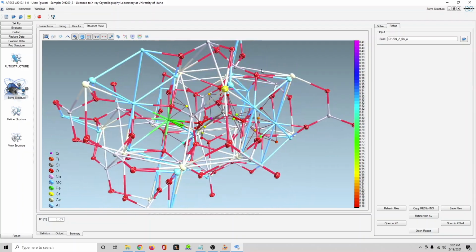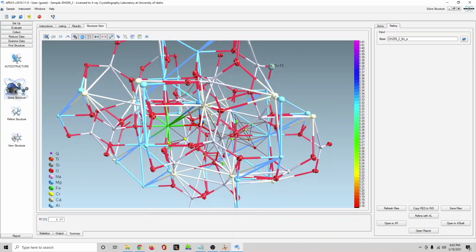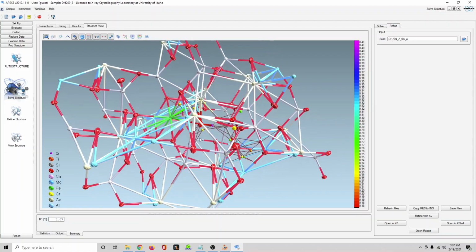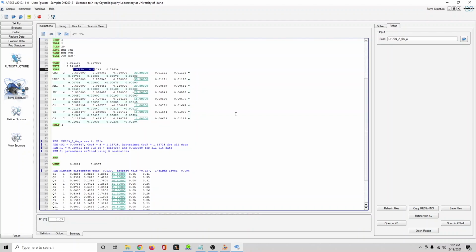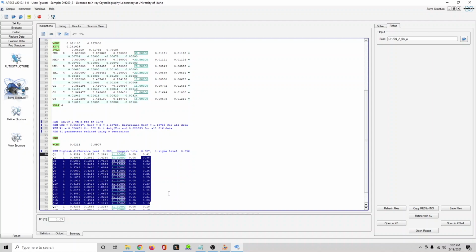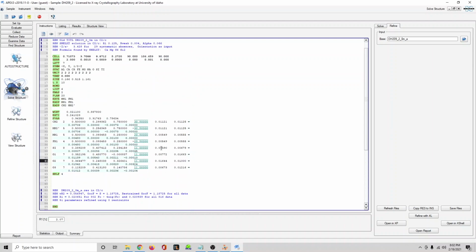So that means that we're at a good point. We're detecting things that are either artifacts or very minor nuances that people have discussed in the literature. And I don't really see any oxygen that could be modeled effectively, because if Q1 is that one, everything else doesn't really stand out of the electron density of everything else. So I think we're at the end of the rope with this sample in terms of just refining it with these elements. The next step could be entering in the composition.